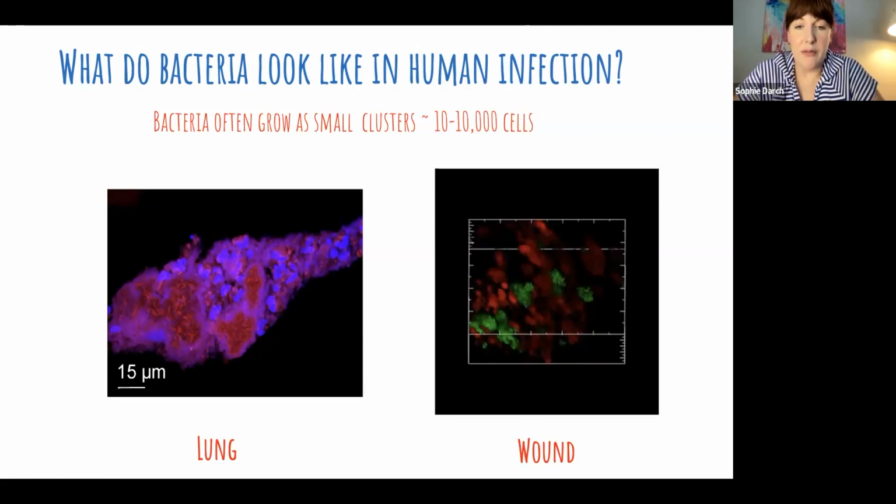This is just showing you how we can visualize Pseudomonas and Staph together in a wound. So this is a nice example of that.